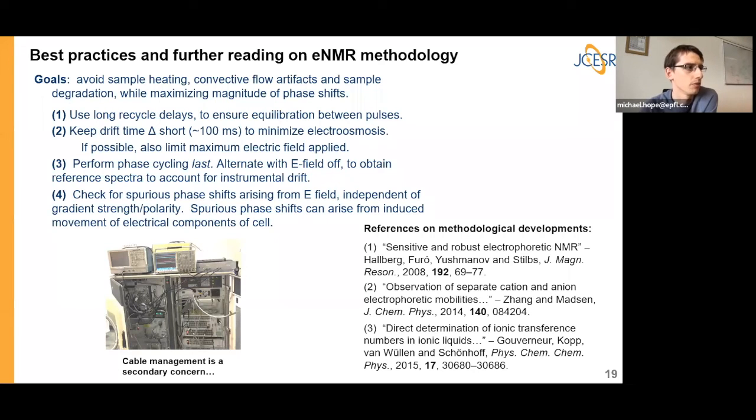So we have a question from Thomas Osman Pop, who says, "Hi David, great talk. Regarding voltage incrementation and then incrementing the phase cycle, do you see a difference between random ordering of the voltage increment versus sequential or monotonic incrementation?"